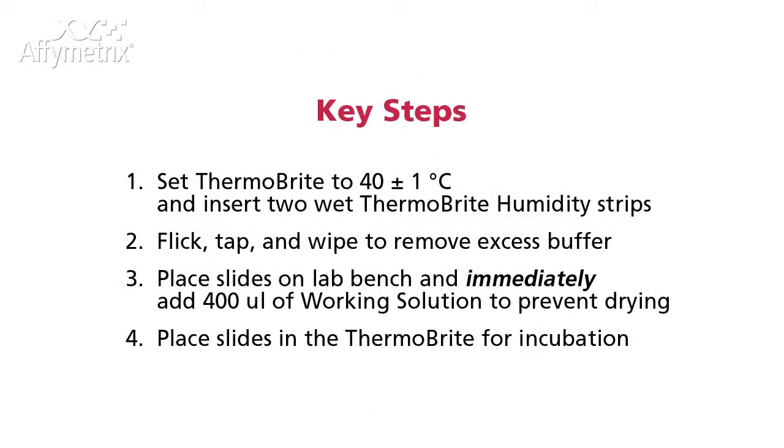Set the Thermobrite to 40 degrees Celsius and insert two wet Thermobrite humidity strips. Prepare the working solution.